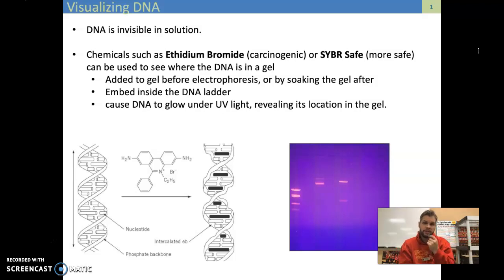So an example of this is you guys just completed a lab where the input was your cheek cells, right? And we had a desired molecule within those cheek cells. That input was our cheek cells. We processed it through a process called cell lysis, which just means we broke open the cells and we isolated the DNA. So what our output of that last lab was 150 microliters of genomic DNA, just meaning all of your DNA, all of your genes, right?